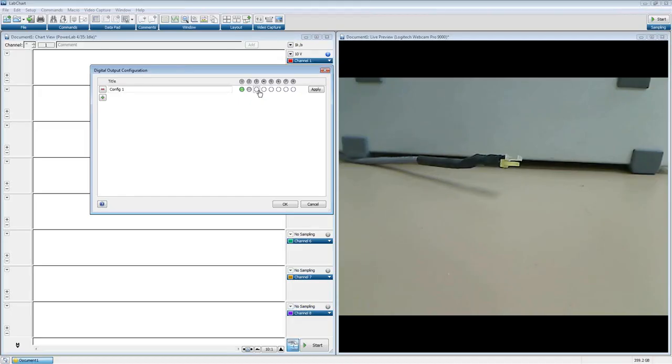So if I leave number 3 here with just the white selected, let's say I have another configuration applied, it will leave it to whatever state it's in. So if it's on, it'll stay on. I'm going to create another configuration. We have 2 on, and we force 3 off. Create another one.